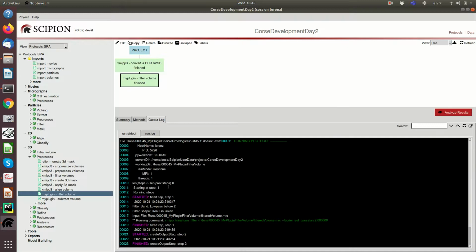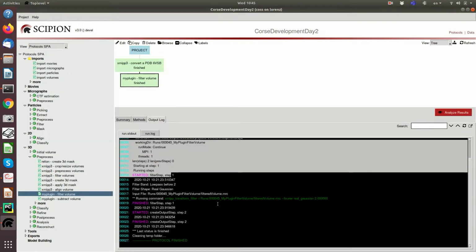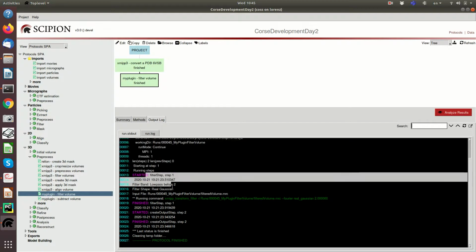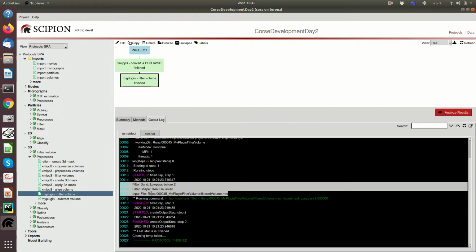And you also have the same or similar information in the standard output. So in the standard output, what you have is almost the same: where you are, and which step you have executed, but here you have a bit more. We are running this command, and we will see how we got this command to run. If this command prints something, it will go into the standard output.